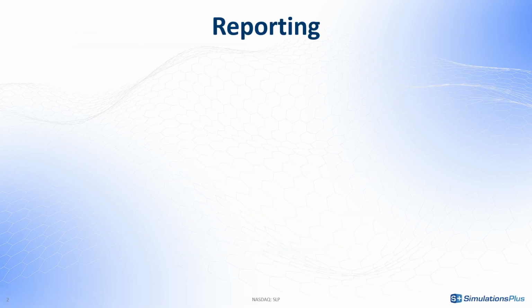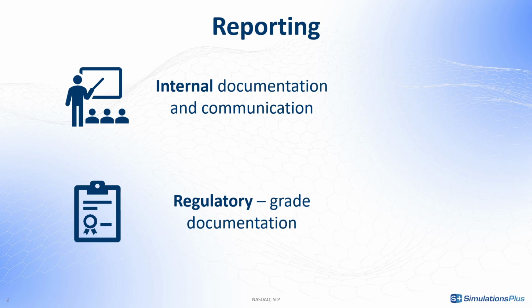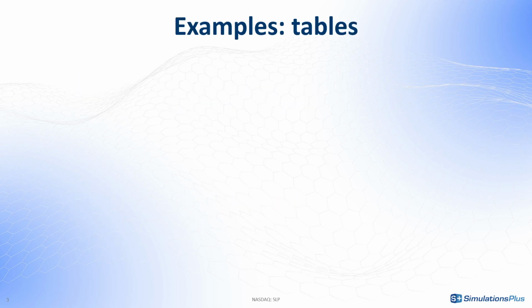As professionals in this field, you understand the importance of robust, clear and compliant reporting. And it's not just about internal communication, but it's also about creating regulatory-grade documents that effectively describe complex analysis. This is why in this video we will explore different techniques to customize tables and other features that can improve your report.